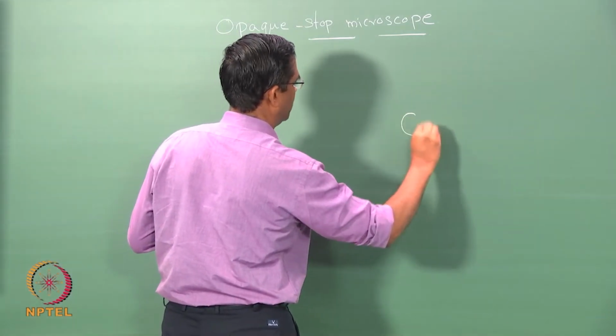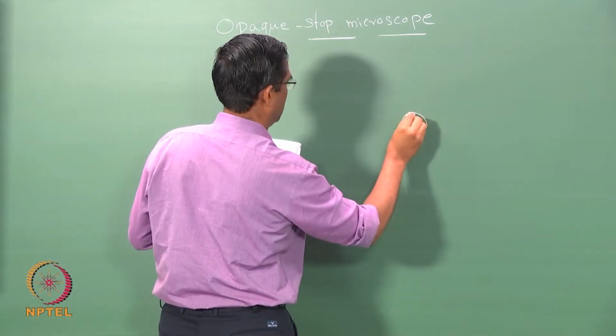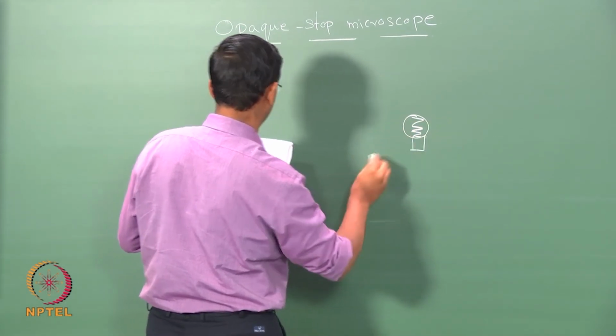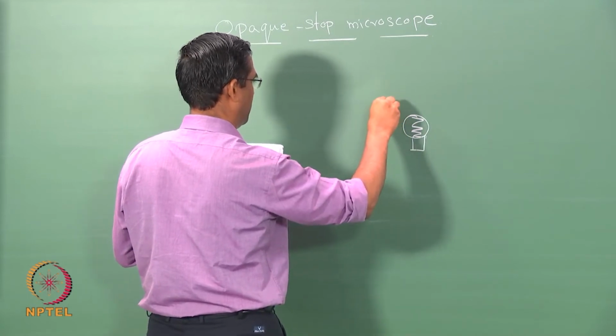You have the light source here, and then you have the condenser.